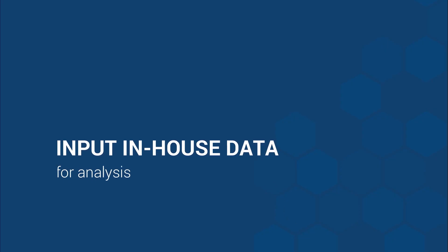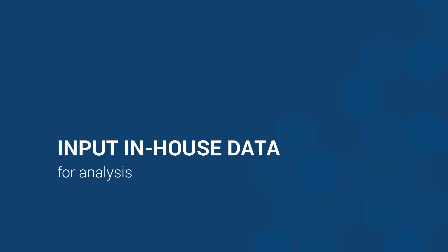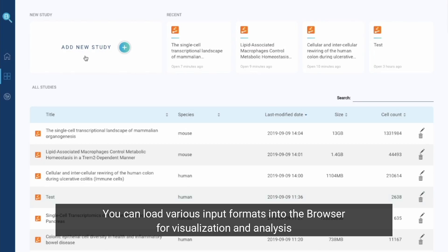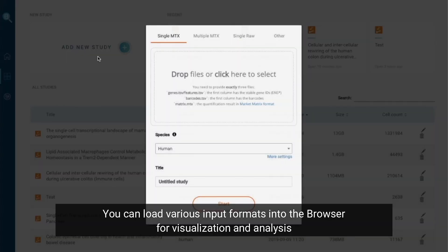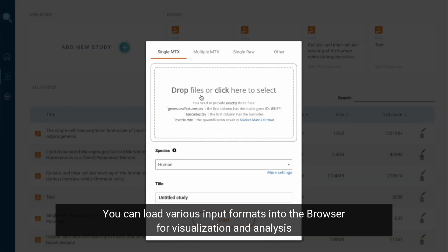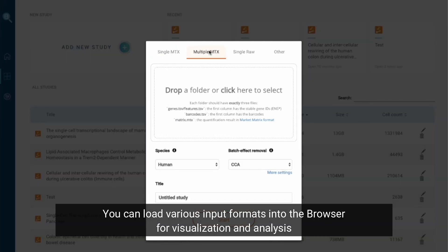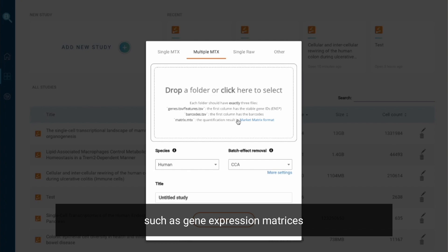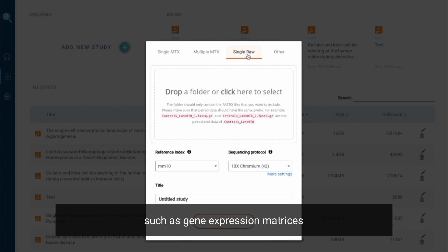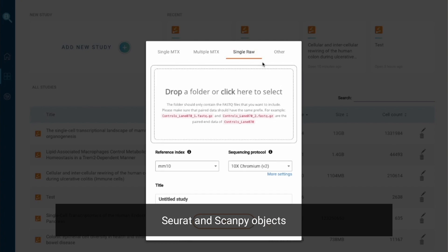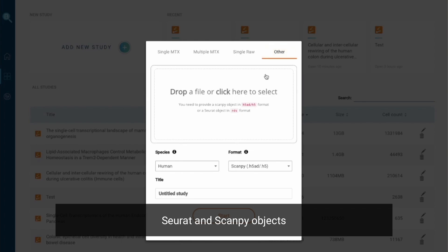Input in-house data for analysis. Apart from browsing published data, you can load various input formats into the browser for visualization and analysis, such as gene expression matrices, FASTQ files, Seurat and Scanpy objects.